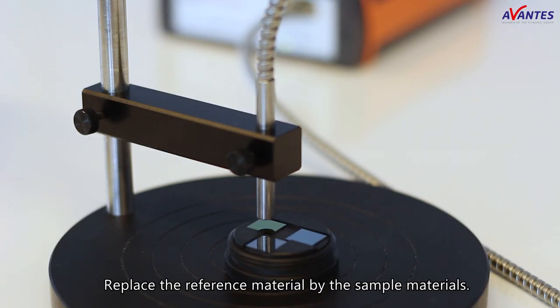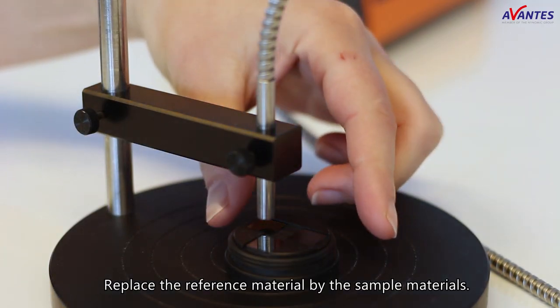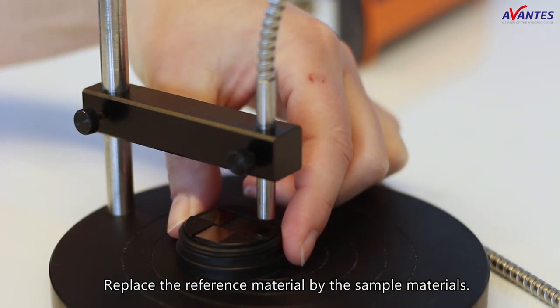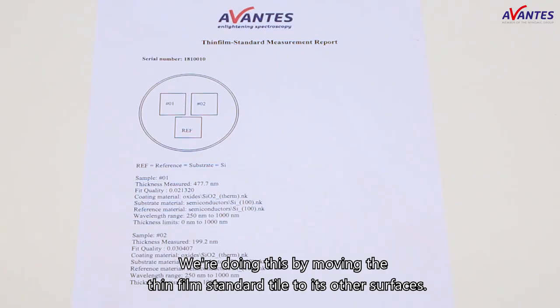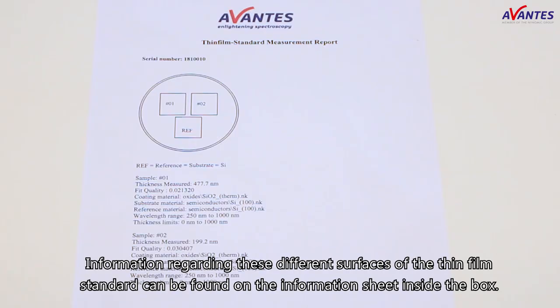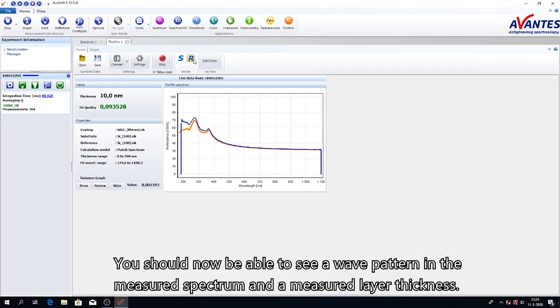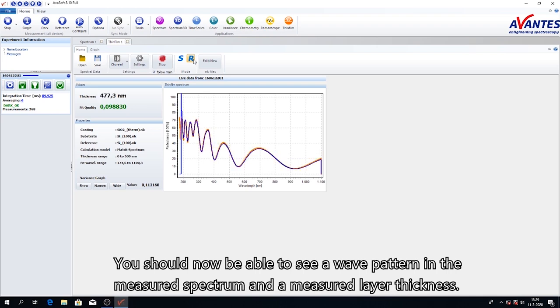Replace the reference material with the sample material. We're doing this by moving the thin film standard tile to its other surface. Information regarding these different surfaces of the thin film standard can be found in the information sheet inside the box. You can now see a wave pattern in the measured spectrum and a measured layer thickness.